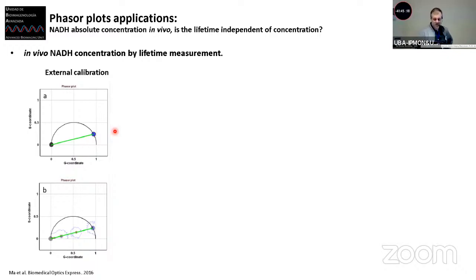Well, this was a paper that we did with Enrico, with Michelle, and Michelle's student, Ningma, where we light our sample with unmodulated light. Unmodulated light is an infinite lifetime for our measurement, which was basically to put a flashlight on the microscope, more or less. Then when we dope our measurement with this flashlight, where will be the position of a lifetime which is infinite?